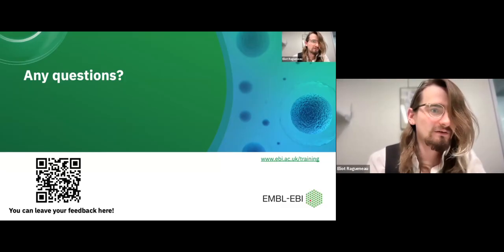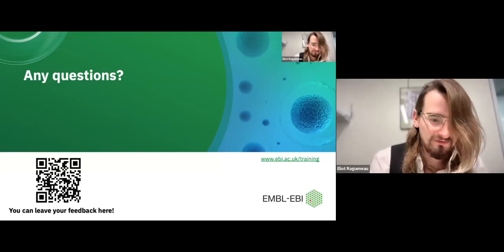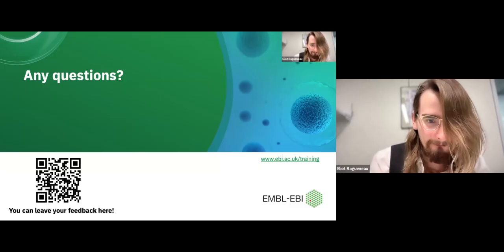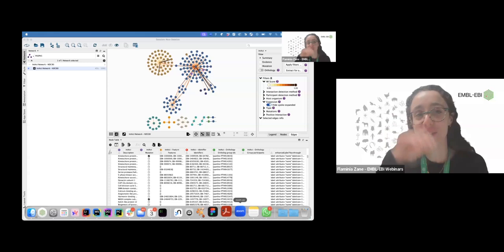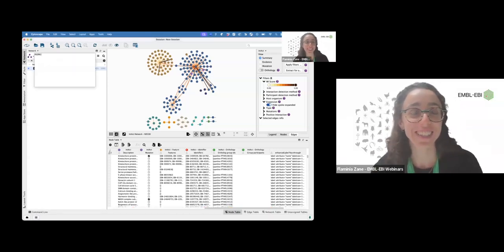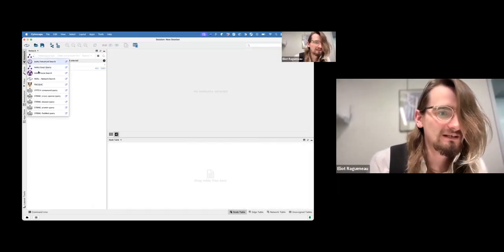So let's go within Cytoscape and query for it. No, we don't have any information about this specific histone. Would you like to share your screen? Sorry, I thought I was sharing my screen already. I thought you were finding something and then you would link, but when you mentioned Cytoscape, I said maybe it's better. Okay, so let's try to find histone in general.